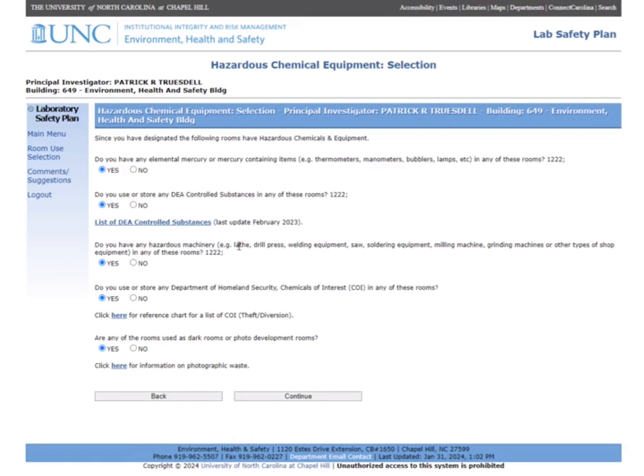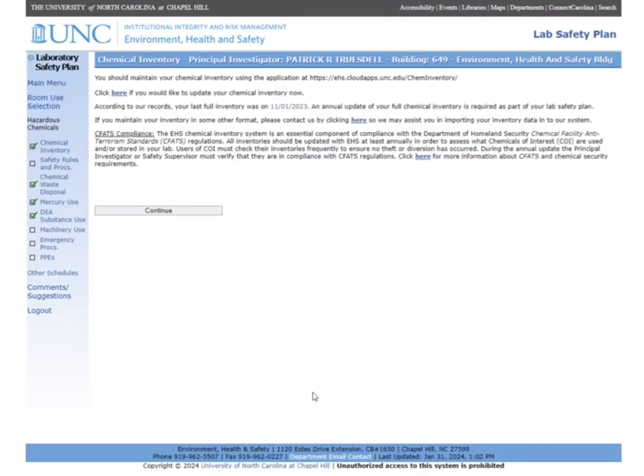Next, we will need to answer the following questions about hazardous chemicals and equipment in our lab. For this example, all the answers will be yes. Every lab is required to maintain an updated chemical inventory. We will go into further detail about how to update the chemical inventory in a different training video.